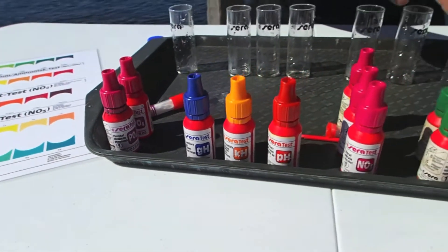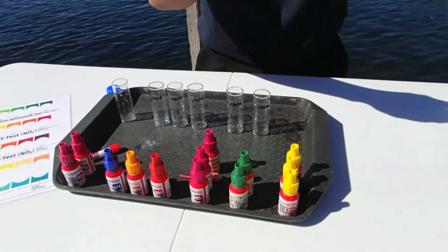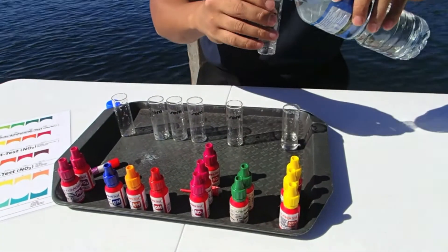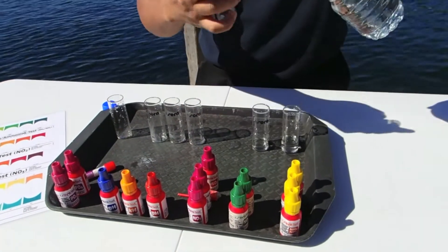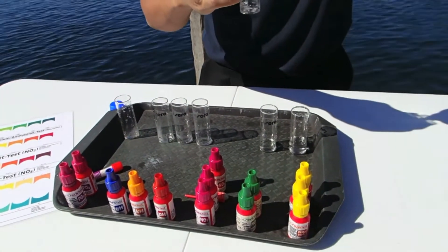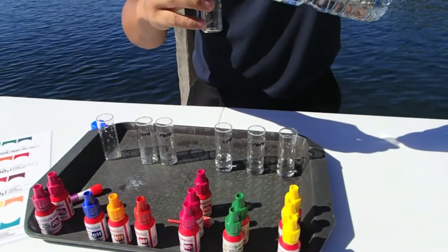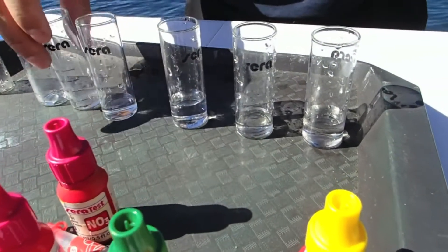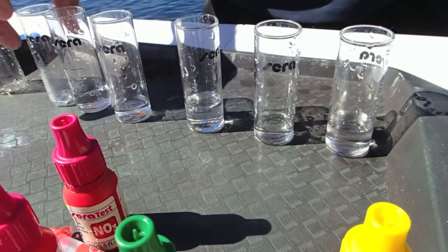Different tests require different amounts of solution. So this ammonia is 10ml, nitrite is 5ml, nitrate is going to be 10ml. And I guess if you do this many times, you will actually be able to do it off the top of your head.